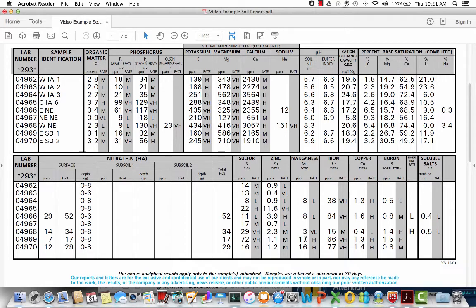All right, enough about manganese. Let's move on to iron. For iron, we're looking at a target of maybe 20 to 25 parts per million. Above that, there's probably plenty of iron in the soil. Below that, we may be having some issues. So as we look through these samples, in general what I find in a lot of Midwestern soils is there's plenty of iron there. There's probably actually a lot more iron in the soil than what we see here in the DTPA extraction. But of course, we're always looking at what those extractions bring out in nutrients, not the total amounts in the soil. So here again, looking at this DTPA extract, we're looking for a target of about 20 parts per million iron. Most of these samples are well above that.